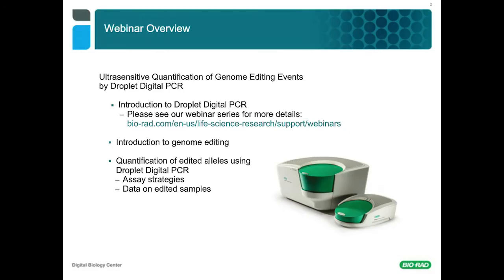So my role at the Digital Biology Center is to connect our leading-edge technology, Droplet Digital PCR, with leading-edge biology applications. Today I'll give a brief introduction to ddPCR for those new to the system, but I encourage you to refer to other webinars in our series for more detailed background on the technology. I will then give an introduction to the genome editing field, and I will introduce how we can use ddPCR plus some interesting assay strategies to detect and quantify rare edited alleles.